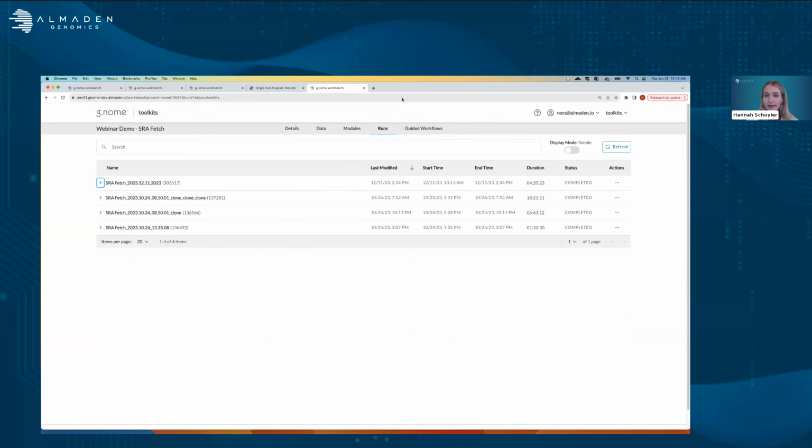Thank you so much, Nora. It looks like there's a few questions that have been entered into the chat box. And again, feel free to type in if there's more that come up. But the first one is, which methods are used for batch effect correction?